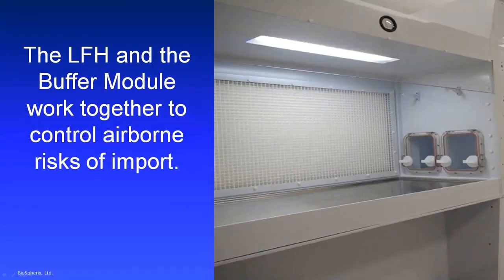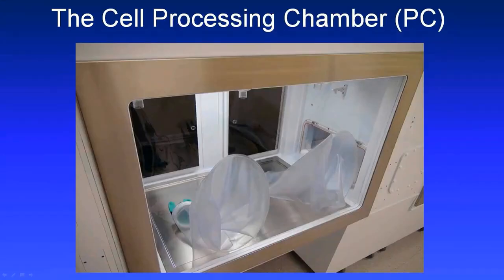So this is how the laminar flow hood and the buffer module work together to control airborne risks to your process during import of materials and export. So the next part of the Xvivo system that you come to is the processing chamber.